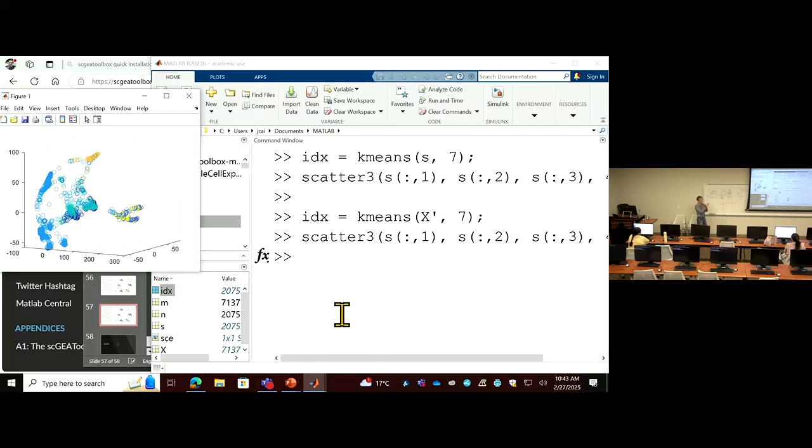Just like I said, the manifold, if you look very close in the high dimensional space, but in reality you have to follow the trajectory, move all the way along the objects of this complex. In that case, the estimation of distance used in the k-means to estimate the distance between cells is not so accurate.